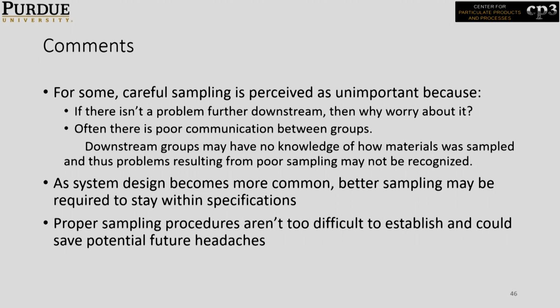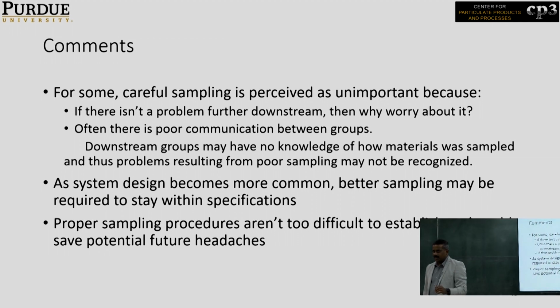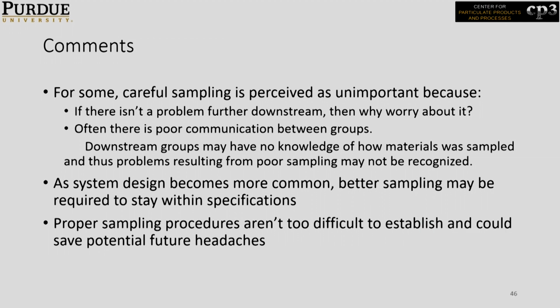So almost towards the end of sampling now, very common. That's what happens, except maybe in the pharmaceutical industry. Pharma, again, as I said, is low volume, high priced material, right? But in grain and food, it's high volume, low priced. So we generally don't care a lot about subsampling, quality analysis, etc.